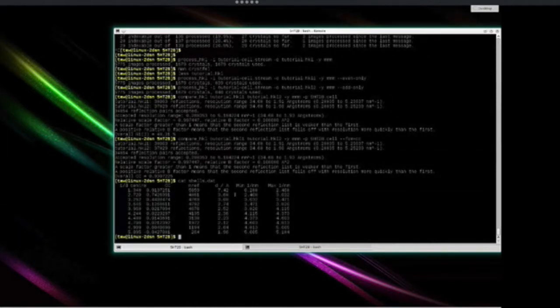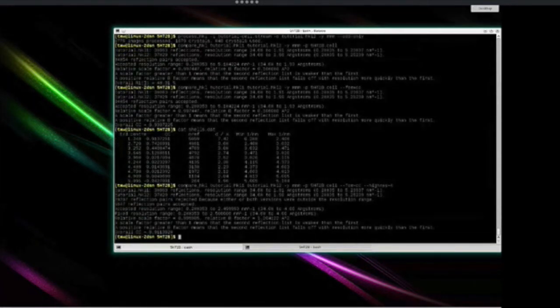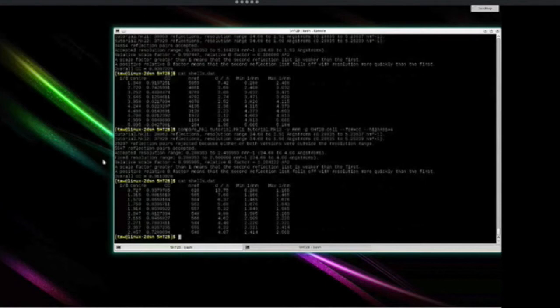You can see that the data seems to die around about 4 angstroms. So there's clearly nothing going on beyond about 4 angstroms. And that agrees with what we saw when we looked at the patterns. So just to make better use of those resolution shells, I can just tell it --highres=4. It just tells it to set the high resolution as 4 angstroms. And then we get slightly different shells, and we can see a bit more detail of where the data goes to.